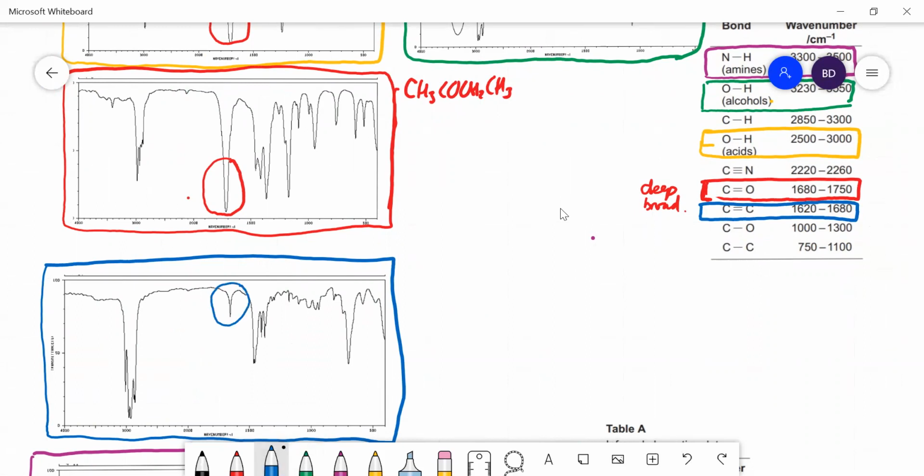Look at that peak. It's a puny little insignificance, isn't it? It's not like the carbonyl peak, and that's characteristic of the CC. So remember that this is small. It's much smaller and it's usually not very deep. It's narrow, yeah. And of course, this, you know by now, is the CHs. And again, that's not much use to us because everything's got them. And if you want to know what that is actually, hept-1-ene, so 7 carbons with a carbon-carbon double bond at the end.